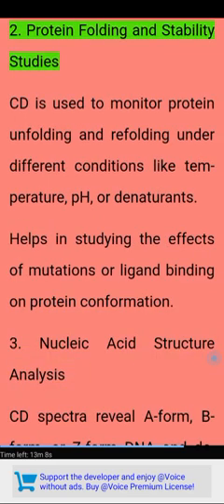2. Protein folding and stability studies. CD is used to monitor protein unfolding and refolding under different conditions like temperature, pH, or denaturants. It helps in studying the effects of mutations or ligand binding on protein conformation.